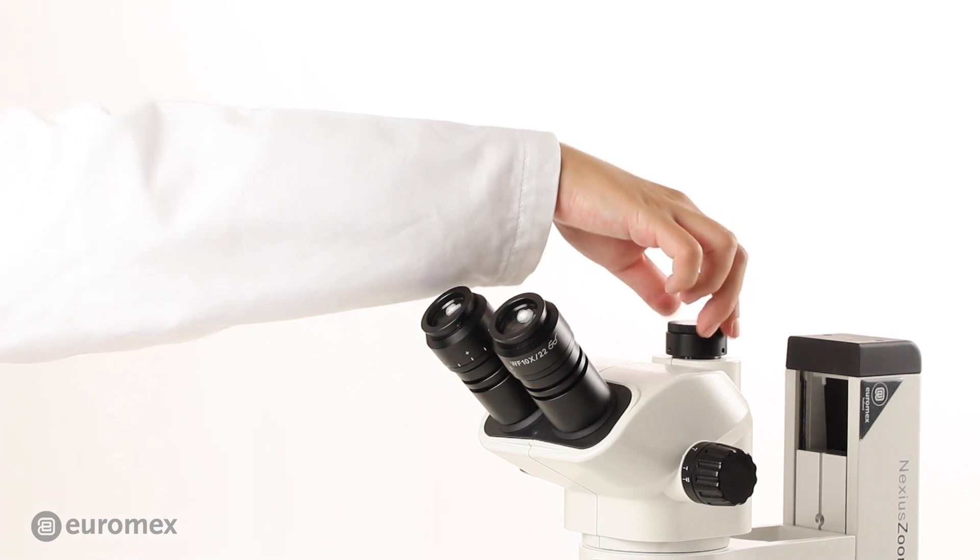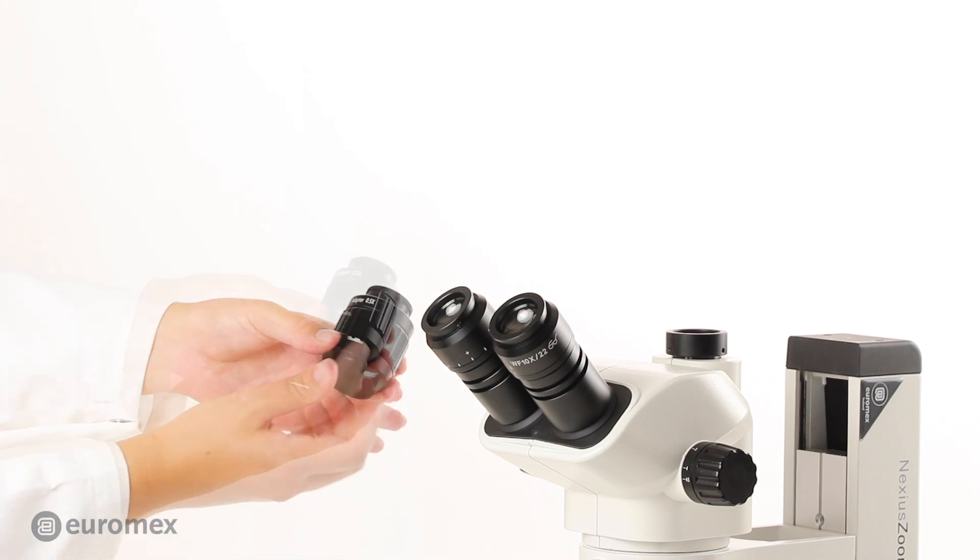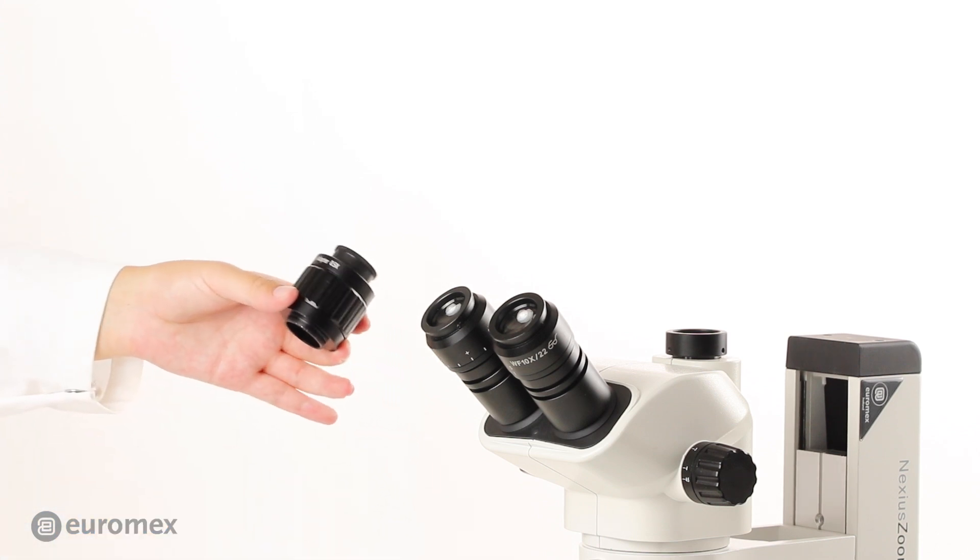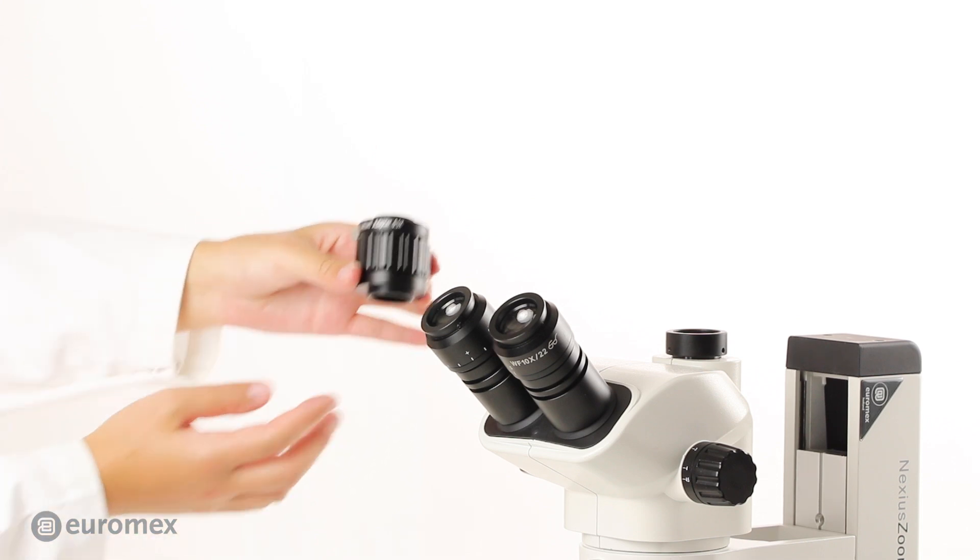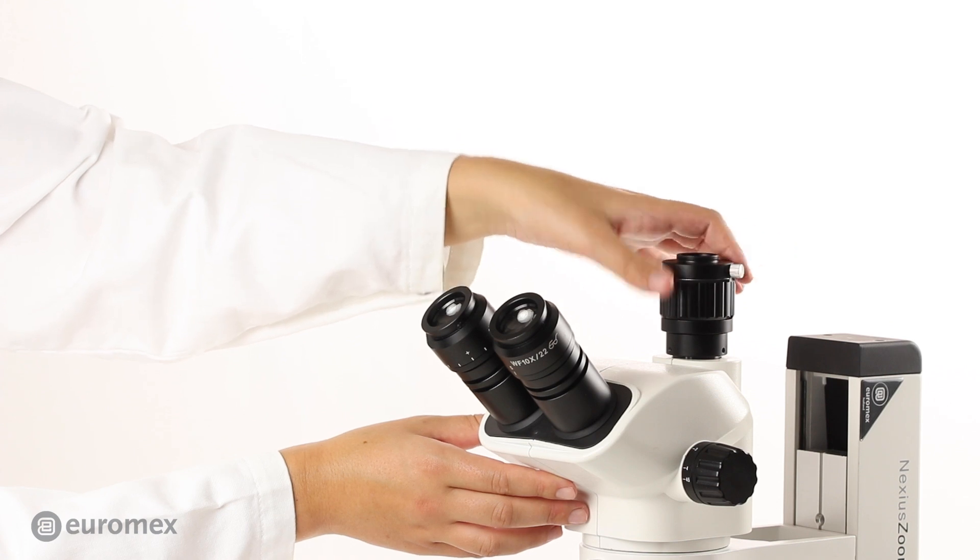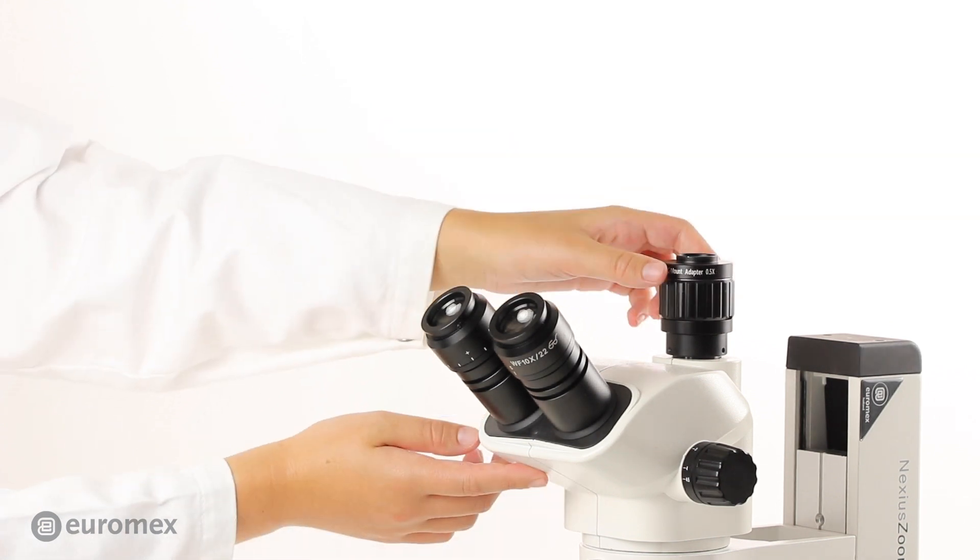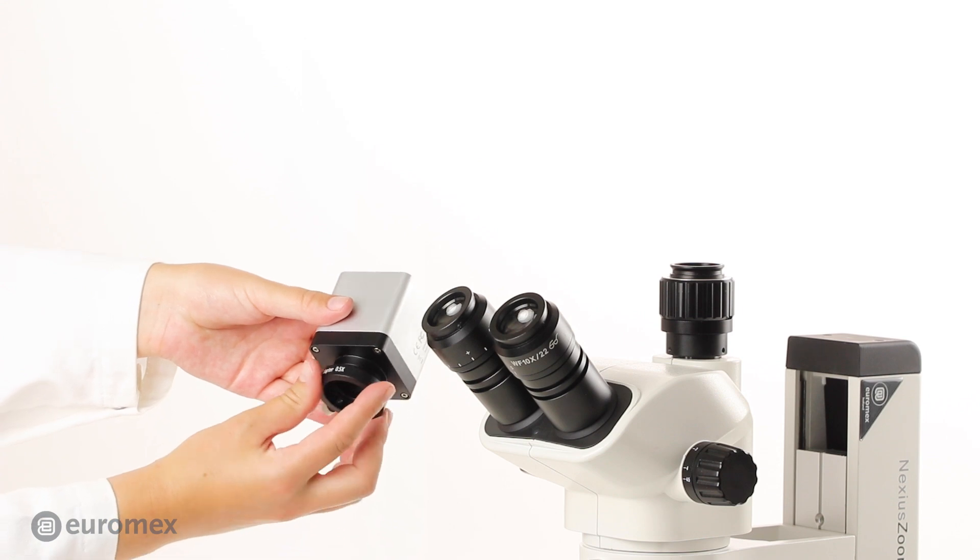How to proceed with an adjustable C-mount adapter: Remove the caps from the adjustable C-mount adapter, remove the ring on the top, and attach it to the camera.